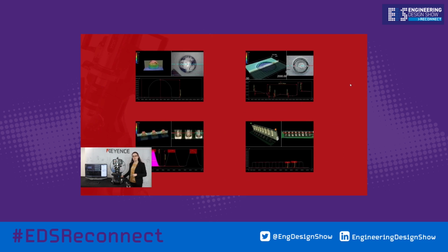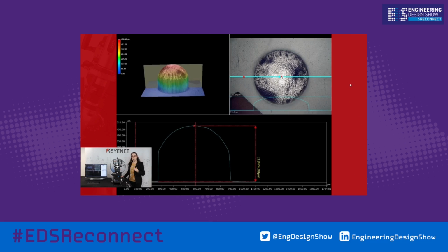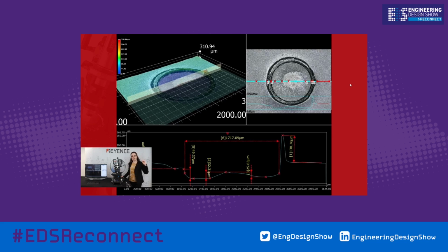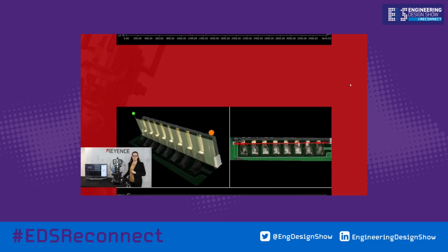Here we've got one of the balls that we've looked at, so a really nice high resolution image of one of them, just to see exactly how high that is raised off the PCB. The second one is actually an indent into some plastic material. We can see there's a large defect on the right hand side of the profile that has been measured. We've actually performed 6 different measurements on this profile, but it's really, really quick and easy to do.